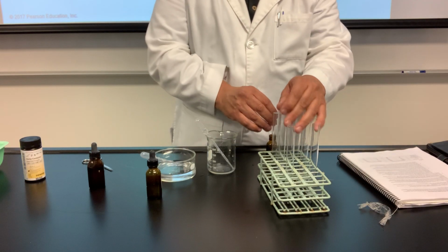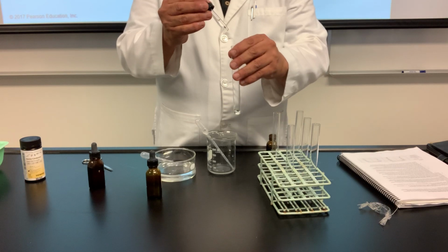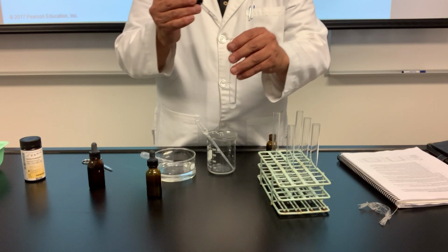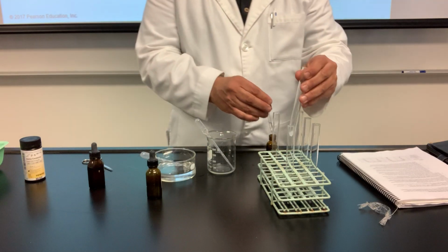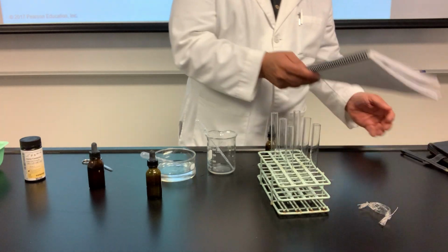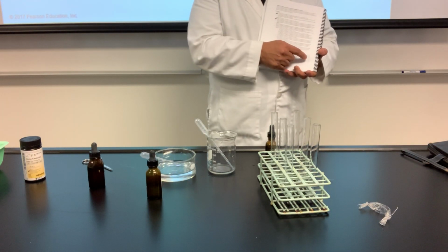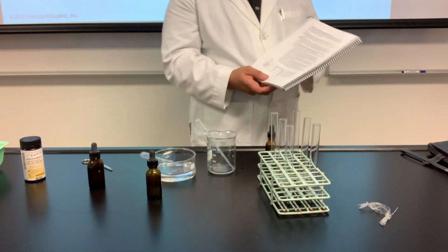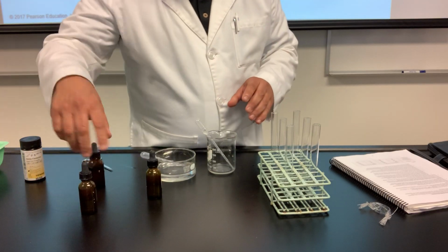The question is, did it leave the bag? Let's see. What are we looking for? A white precipitate. What do you think? Yes. It did leave. So for the chloride ion, it's plus, plus. After dialysis, plus inside. After dialysis, plus outside. Okay, so these are the indicators that we're using.